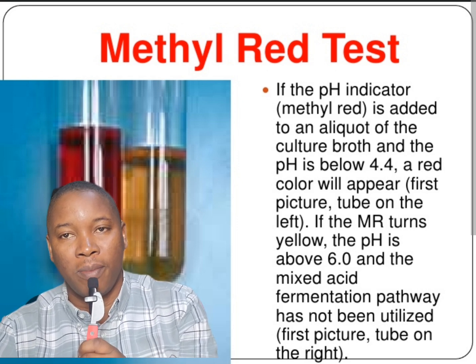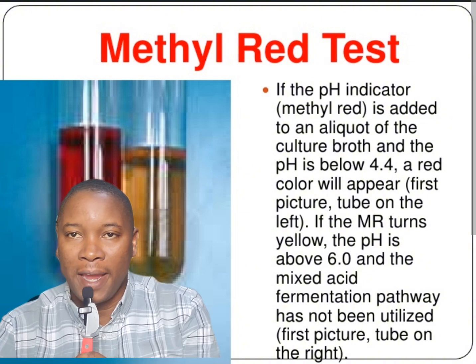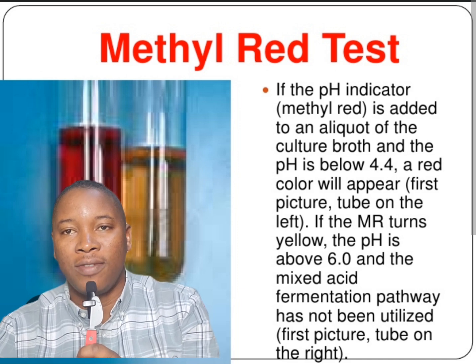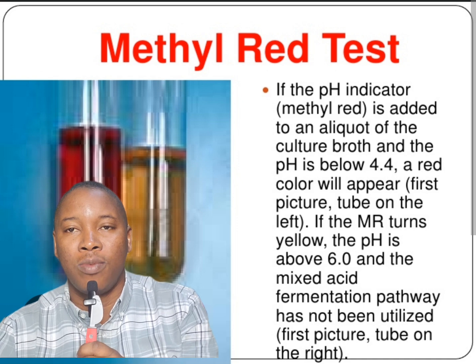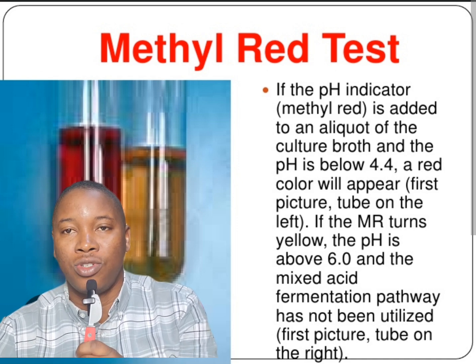They are really close. Remember, they're a family of microorganisms. So sometimes it can be difficult to identify them one from the other, but these tests help us to identify them differently. Today we are zeroing in on the methyl red test, which is a unique test because it helps us identify if a medium has become more acidic than it used to be before.